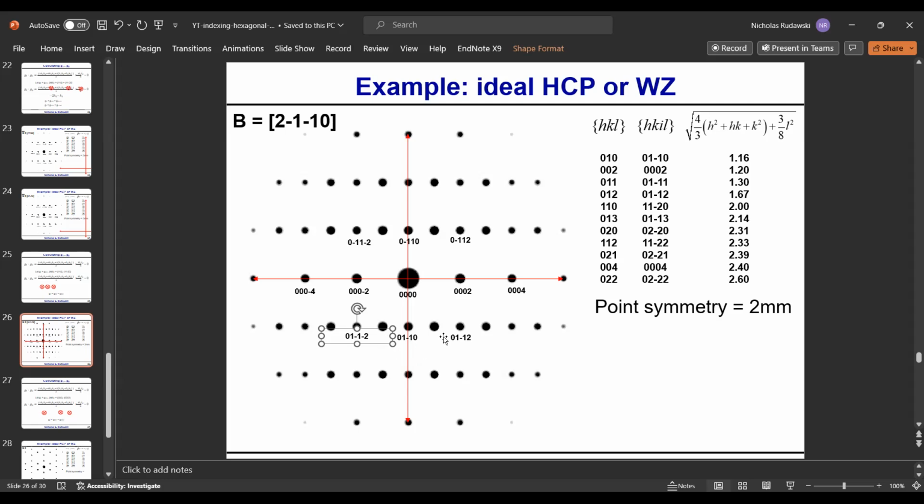All right, so now, how about some of these other ones right here? For this one, we have to imagine that if we had 0, 0, 1, we'd have to add that to this. So what do we get here? We get 0, 1, 1 bar, 1. I didn't make the spacing too long.